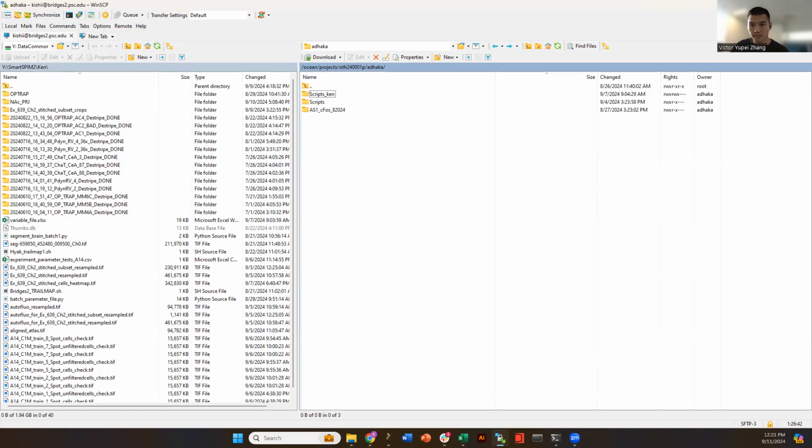I would say especially when you get to the later part of the training, the classifier is doing so well it doesn't need too much more new information. In that case, you probably don't need to add more labels. So there may be a point that you don't think you need to do any new labeling to the images. But typically you will do one label per crop and then go through all the crops from all the brains and generate one big classifier that you can apply for everything.